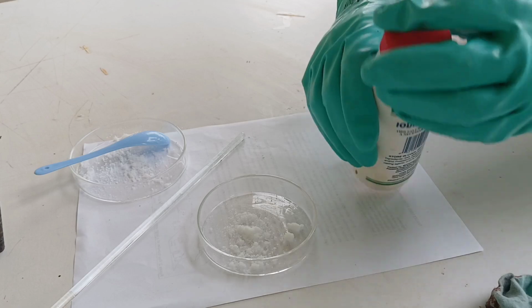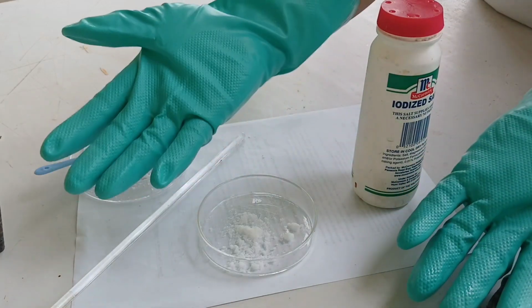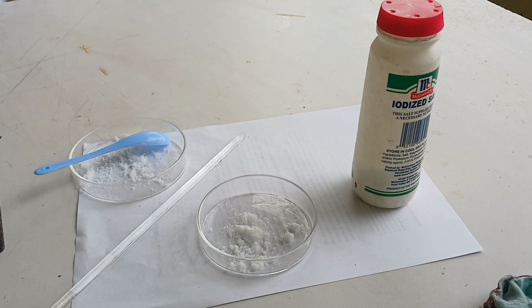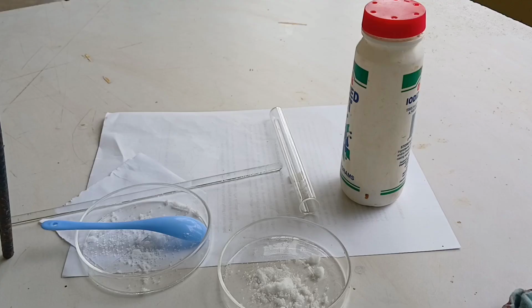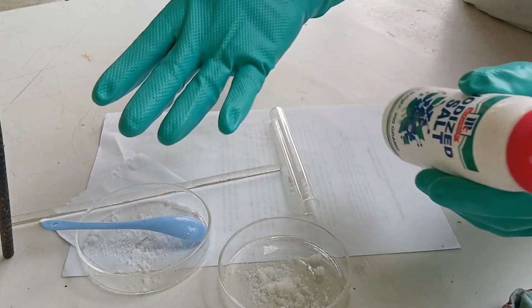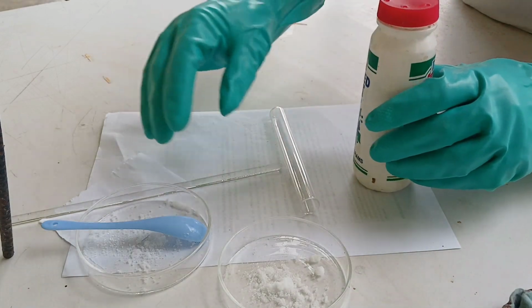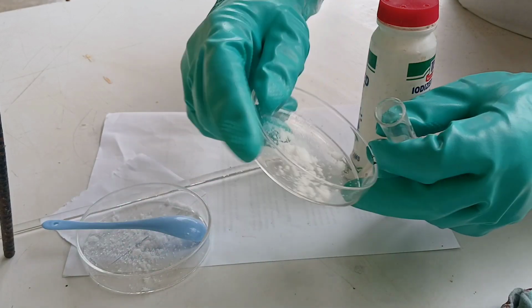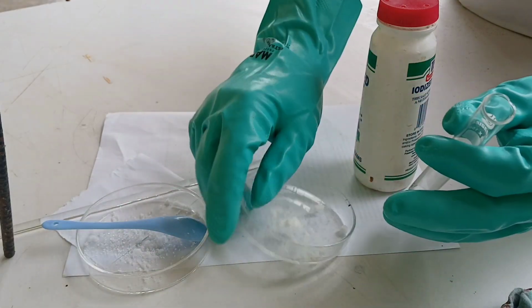And as simple as that, you return the lid to the container and that's all. That is a method to transfer solid chemicals. That's the common technique you have to do and observe in the laboratory. And here comes another way. Say for example that your container is very narrow, so a narrow mouth container.